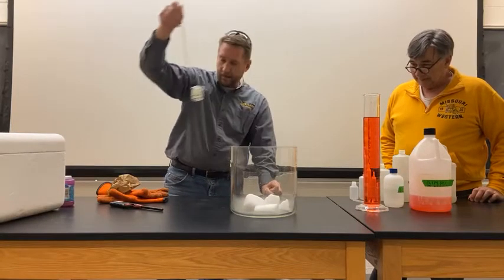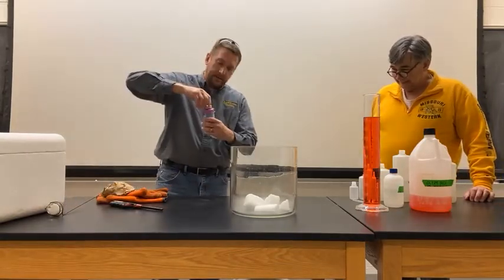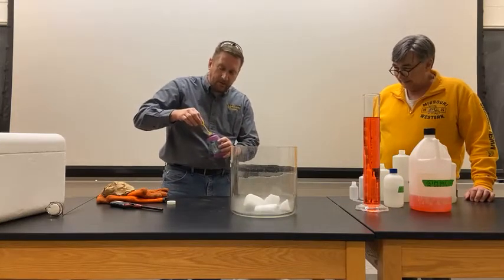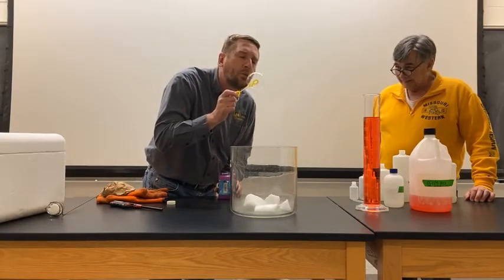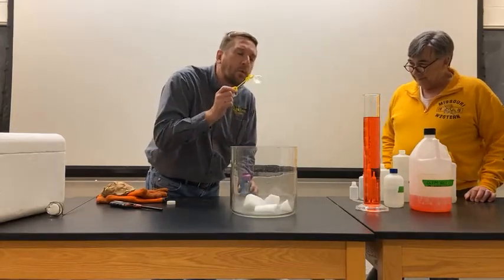Yep. Okay. Now let's see if I can blow some bubbles in there. So again, like I said, just kind of fill it up with CO2, displacing the air in there. So let's see if I can put a bubble in. It was a good sized bubble, but.